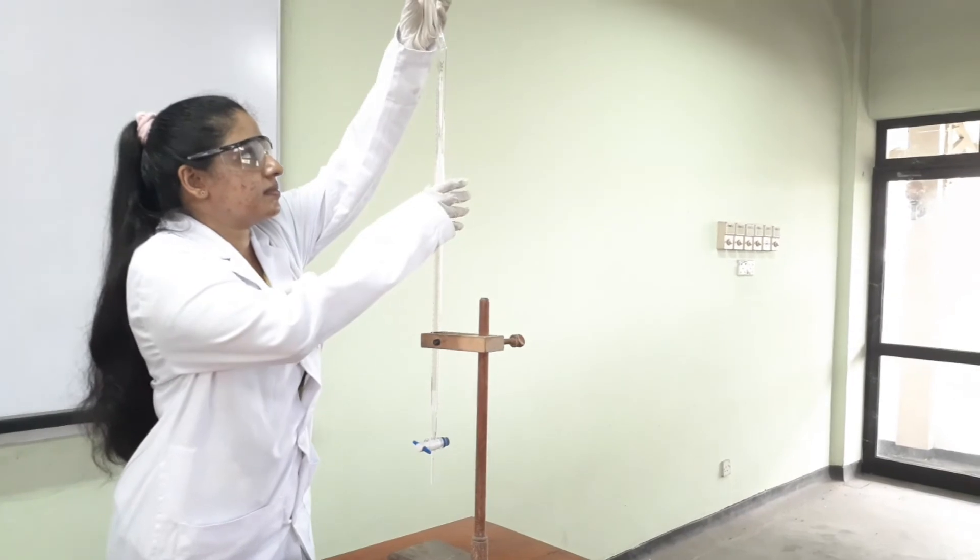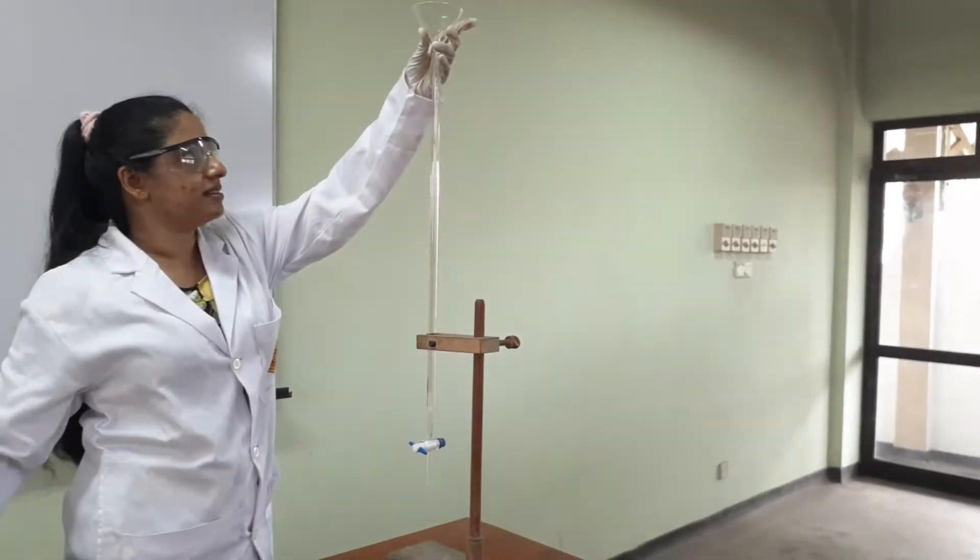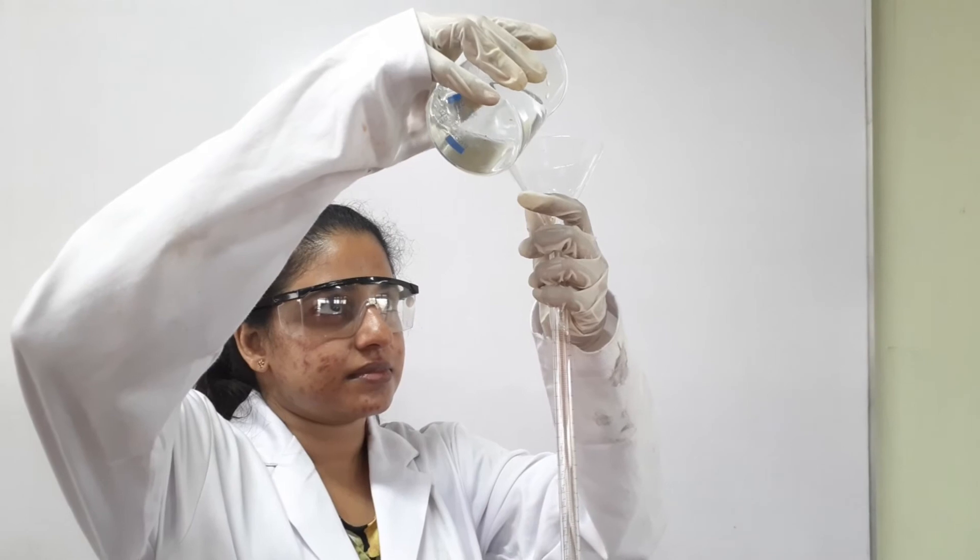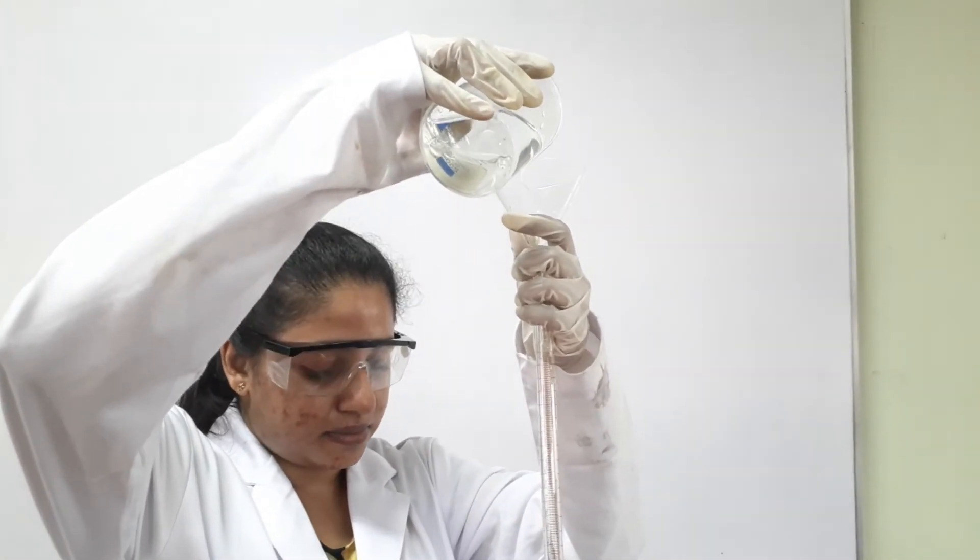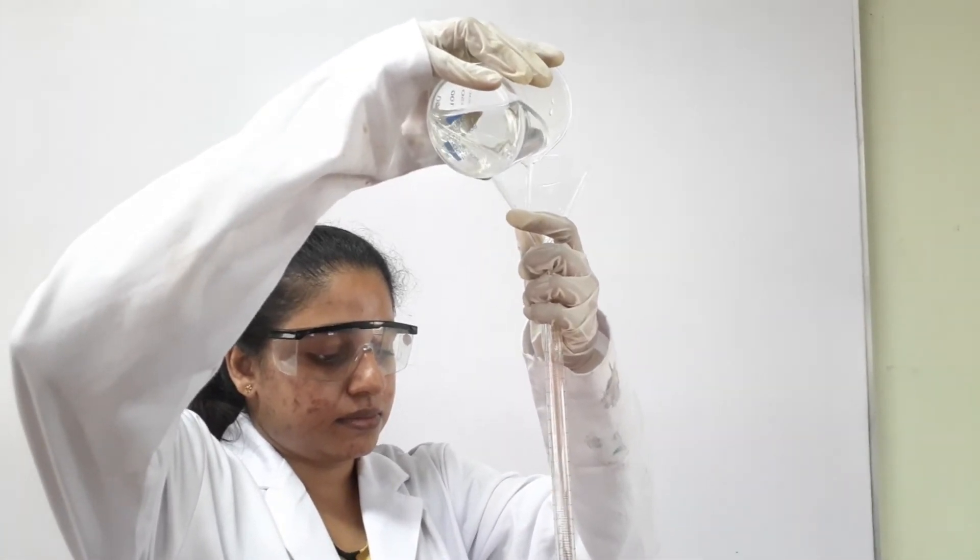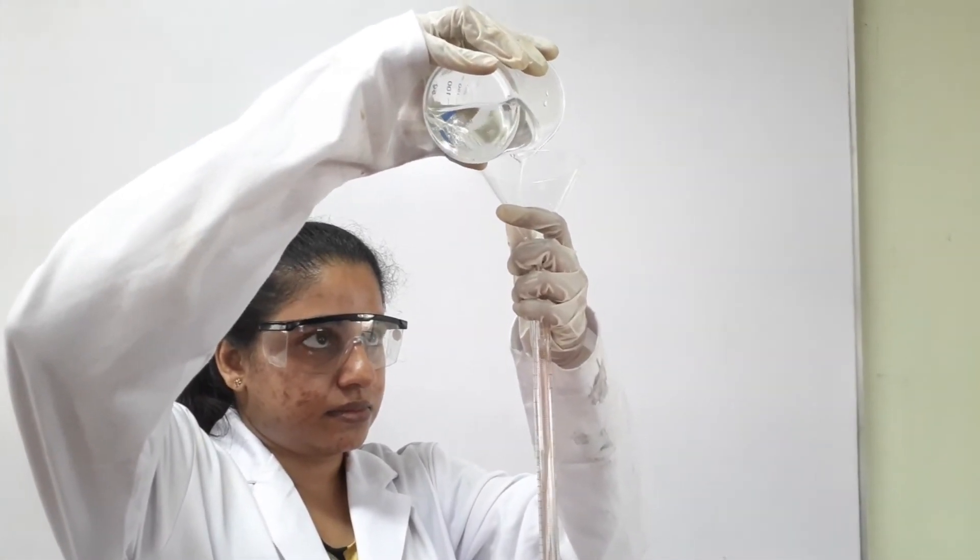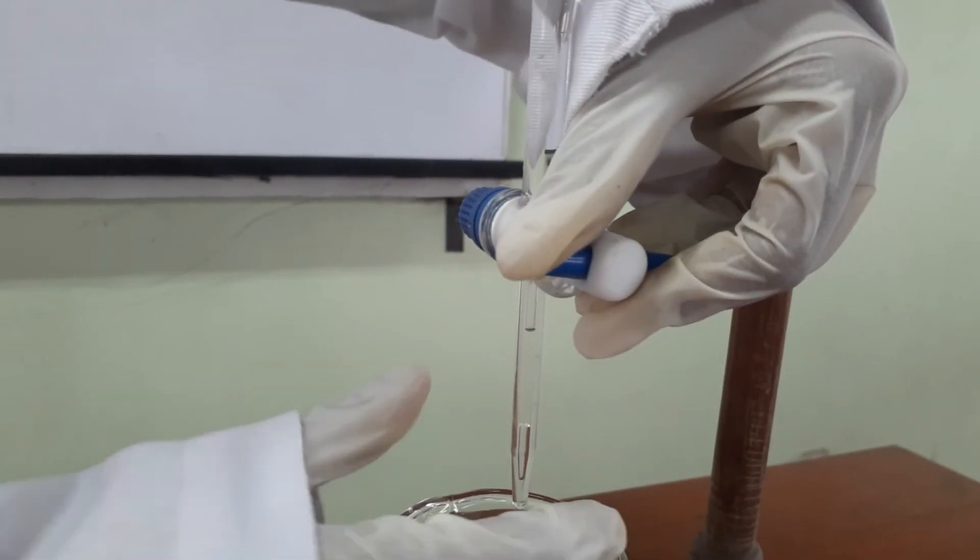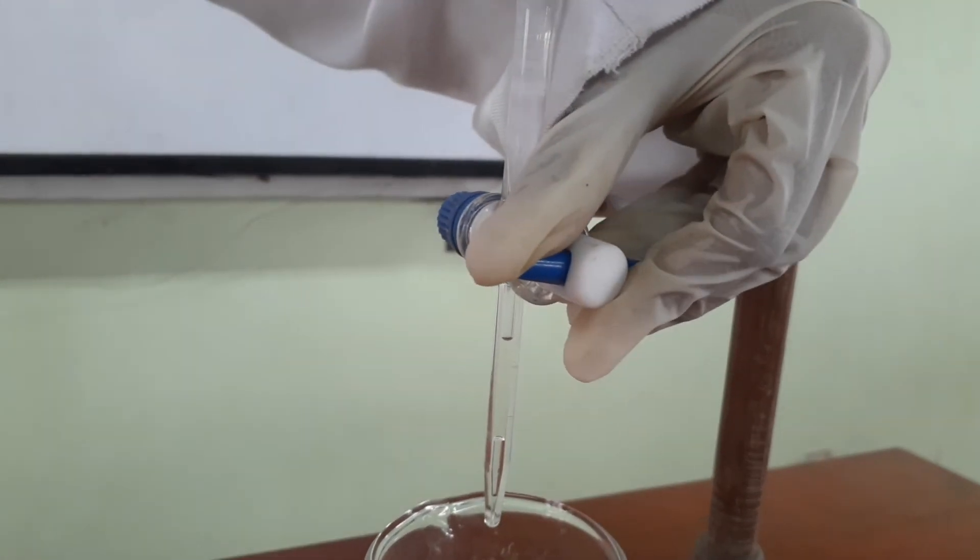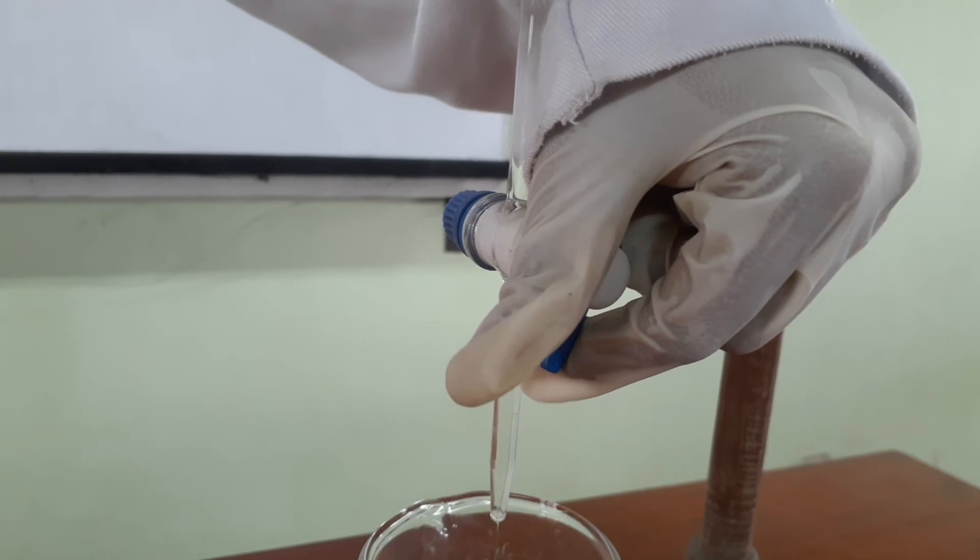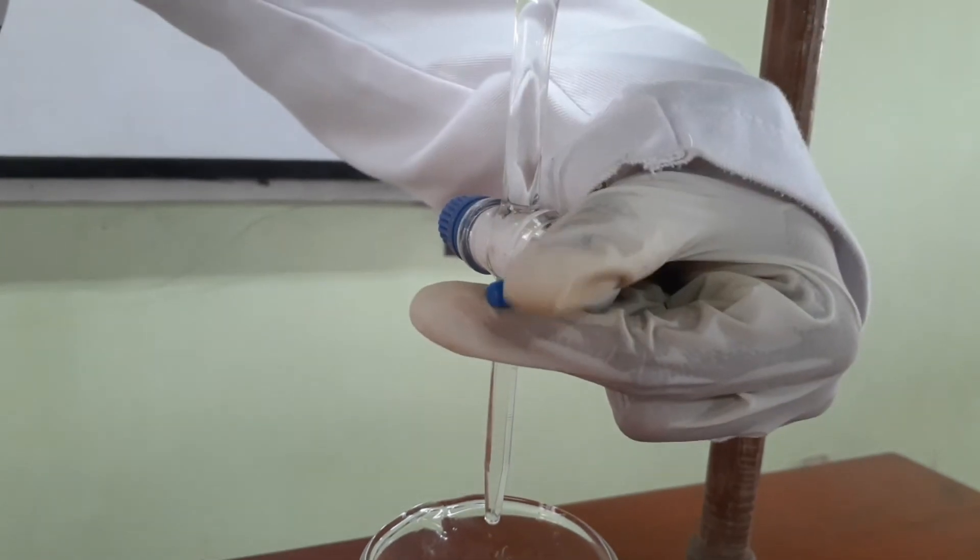Then place the funnel at the top of the burette, making sure the tap is closed. Then pour the solution into the burette up until it is filled 2 to 3 cm up above the 0 mark. Once it has been filled fully, take the funnel out of the burette. Then open the tap of the burette to let out some of the solution into an empty beaker, allowing the solution to fall from the burette tip. The tip must be checked if there are any air bubbles.